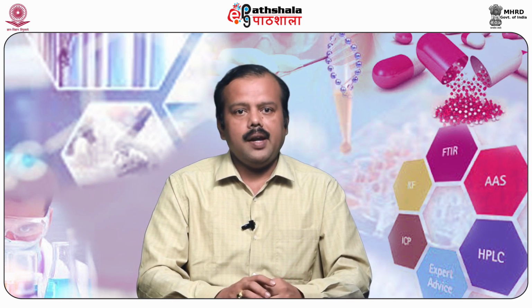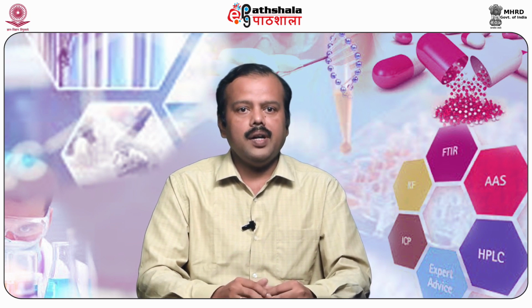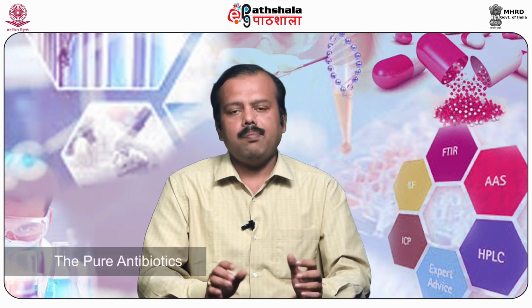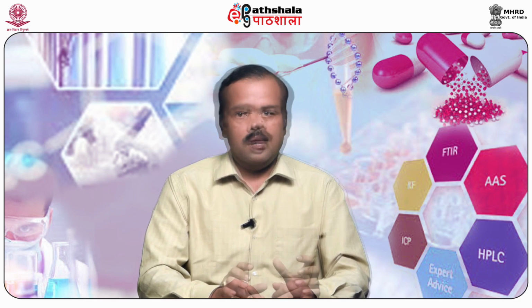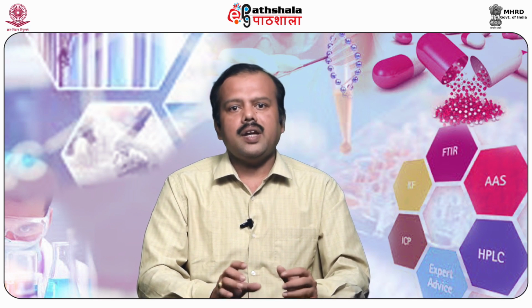The potency of the standard preparation, explained in table number 2, is expressed in international units or microgram per milligram of the pure antibiotic. The standard preparations for India are maintained in Central Drug Laboratory, Calcutta.